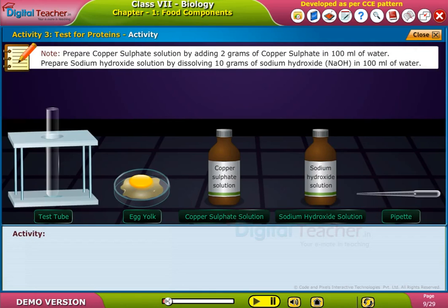Prepare copper sulphate solution by adding 2 grams of copper sulphate in 100 ml of water. Prepare sodium hydroxide solution by dissolving 10 grams of sodium hydroxide (NaOH) in 100 ml of water.